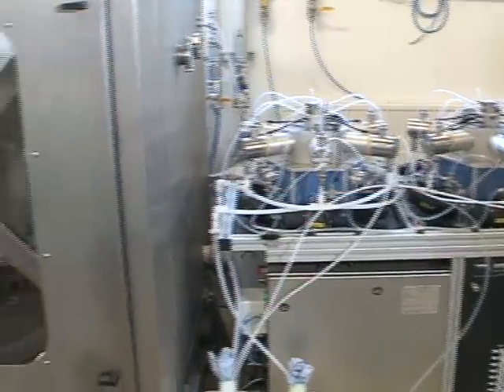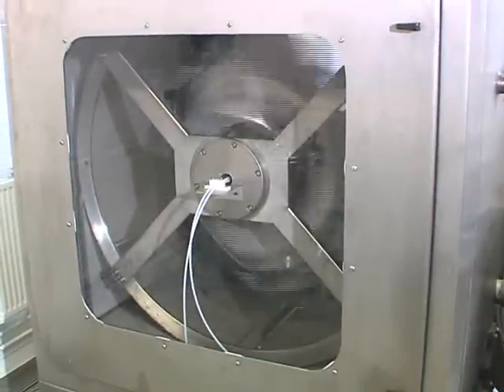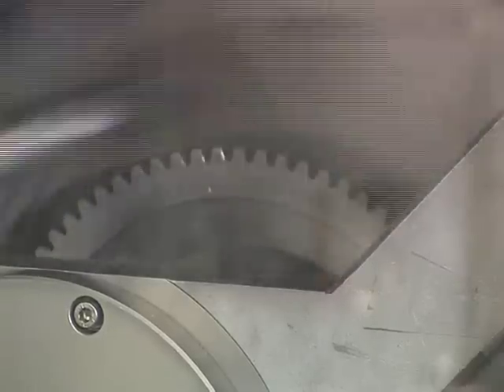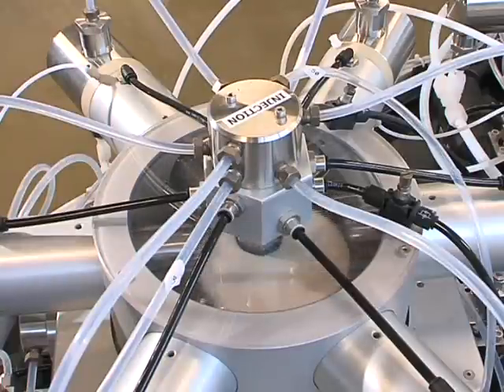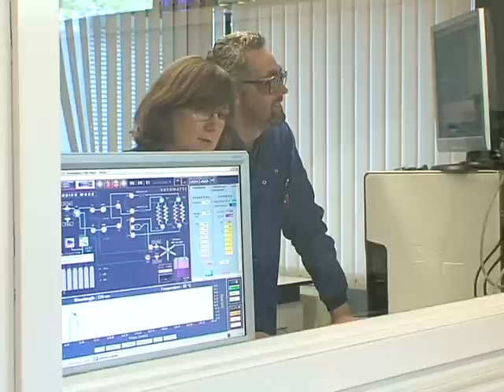When a sample is introduced into the centrifuge, it will experience an enormous number of mixing and settling steps. A typical countercurrent chromatography coil may have 30 loops and spin at 1,200 RPM. It will therefore undergo 2.16 million partitioning steps per hour. That is 30 loops times 1,200 revolutions per minute times 60 minutes in an hour.